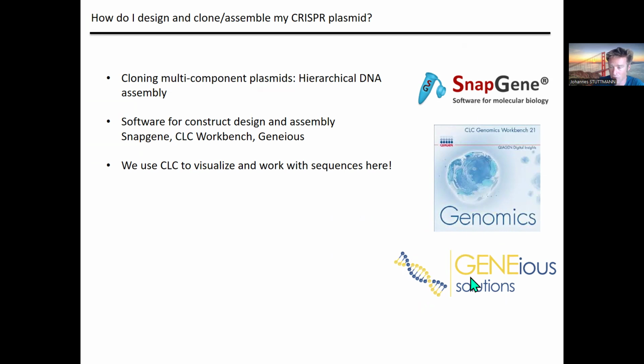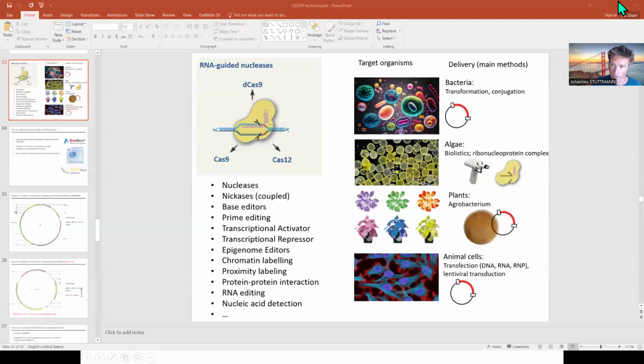So every one of these softwares, I think, is very nicely adapted for editing and working with sequences. And Genious can also treat next generation sequencing data, just like the Genomics Workbench. And the Main Workbench that we have been using in the course and I want to present here now is just, I think, more or less the cheapest of all solutions. So if we want to use this, we have to get the software.